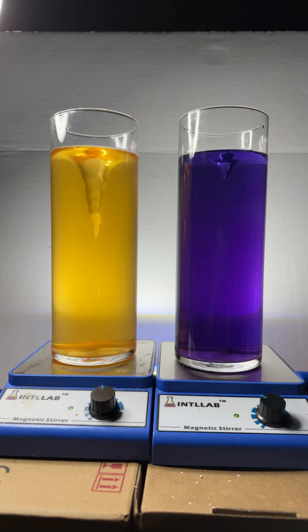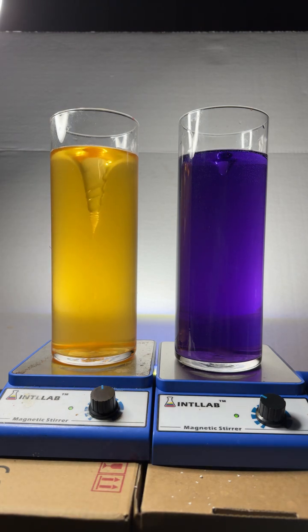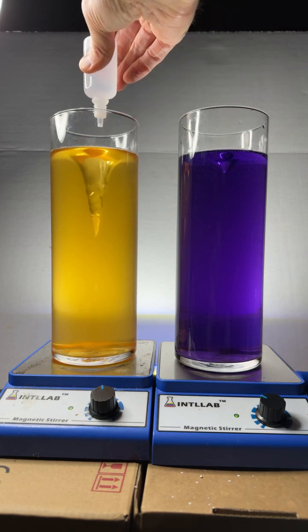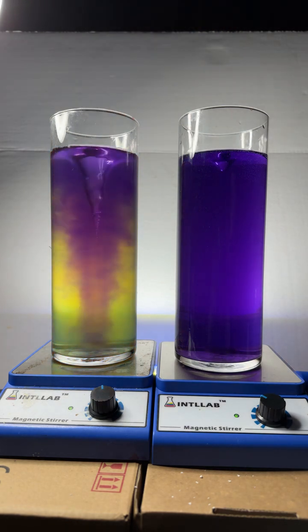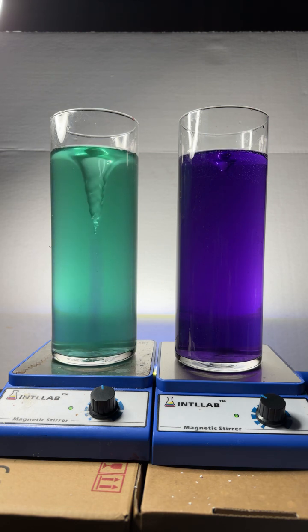I want to see if I can actually get the pH of the buffered solution to change. Instead of adding drops I'm going to add a big squirt. Would you look at that — I added an enormous amount of base and the pH only changed from 6 to 7 in our buffered solution. Isn't that crazy?